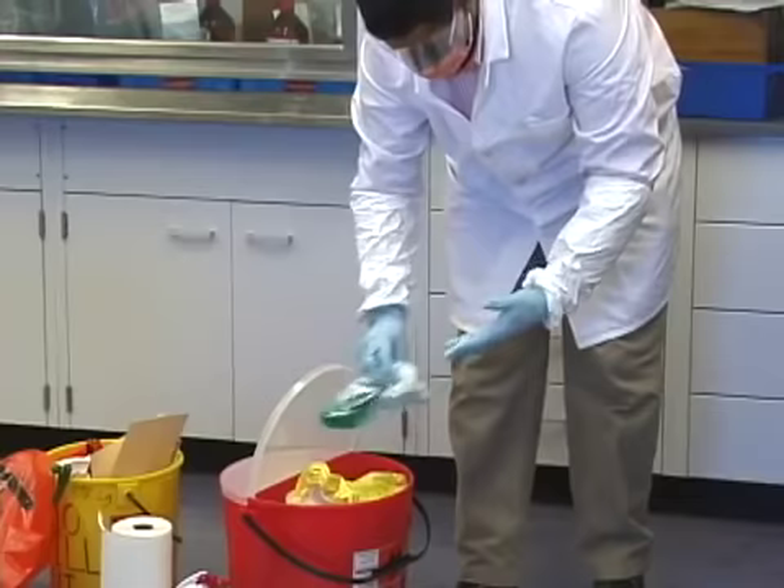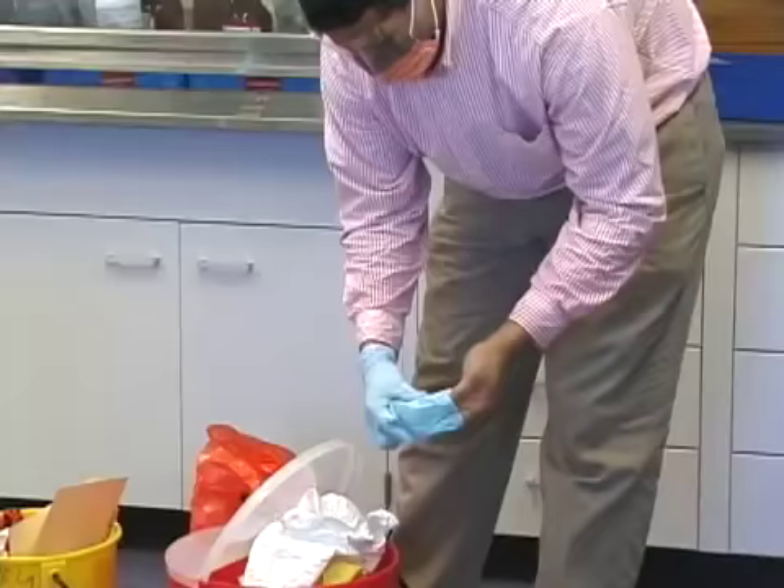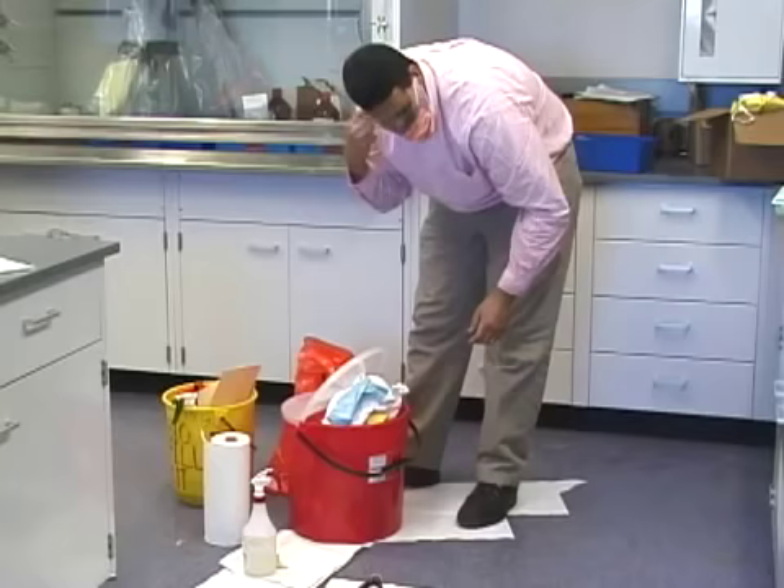Continue by removing your lab coat, then your inner gloves, and finally your face protection.